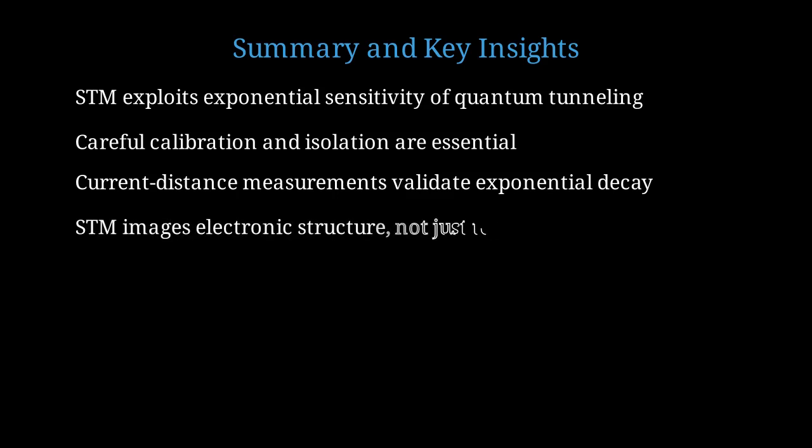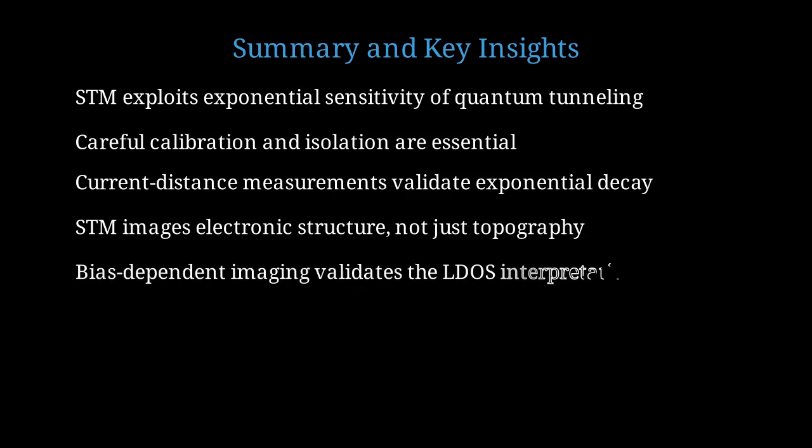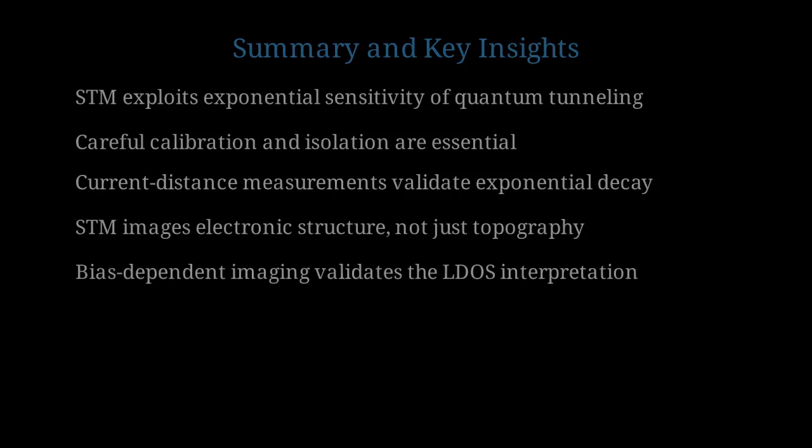The STM images electronic structure, specifically the local density of states, not just atomic topography. This makes it a spectroscopic tool. Voltage-dependent contrast changes provide powerful validation that we understand what we're measuring. Different biases probe different electronic states.